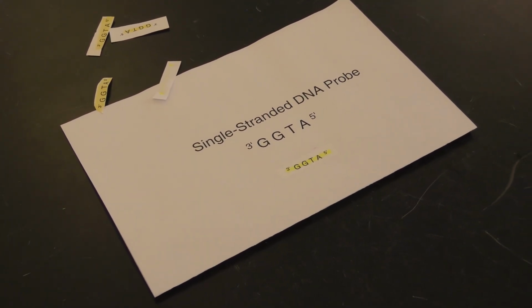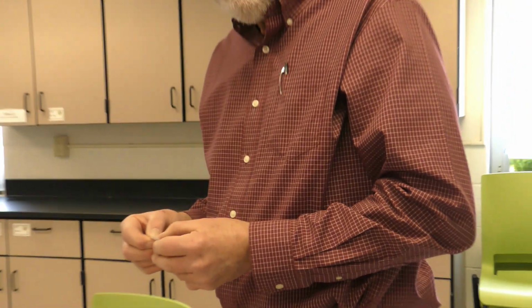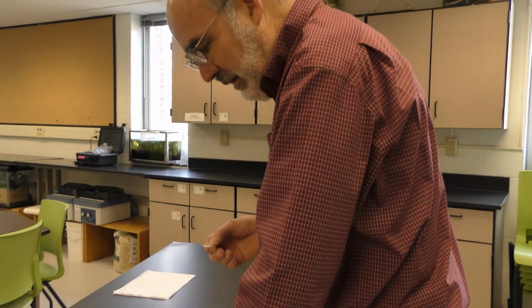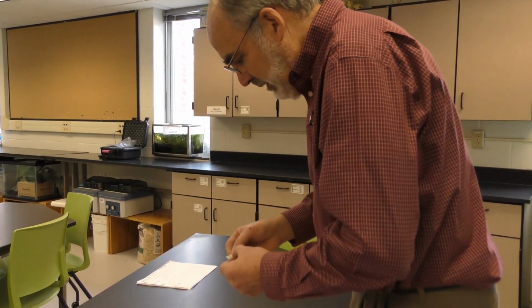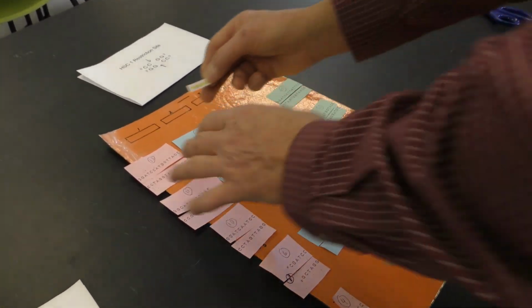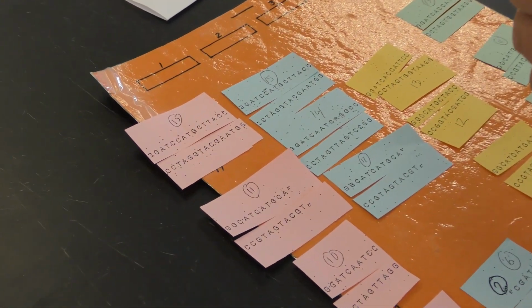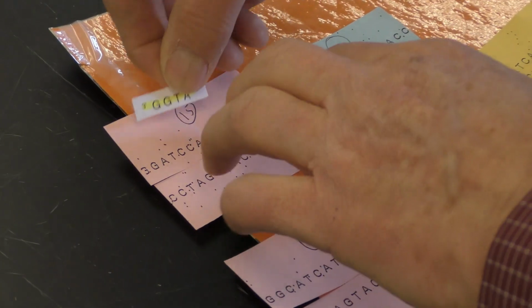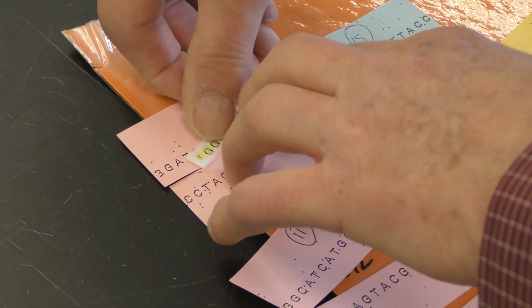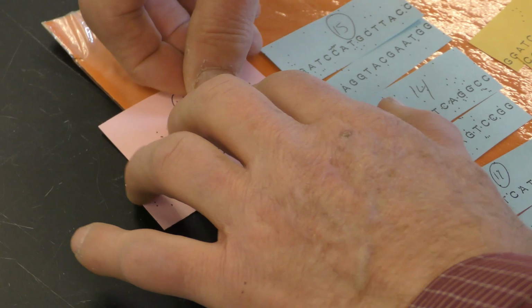Now, think in your head, what you know about the DNA sequences and structure, what they bind to, what's a complementary sequence to GGTA? Okay, it would be CCAT, okay? And since this probe is in the 3' to 5' direction, it's going to hybridize with the CCAT on the top strand, which is in the opposite direction. So look at the top strand of all those fragments for a CCAT, and I found one right here. And so that probe will hybridize with that sequence. And best I can, I'm going to put it right there. CCAT. So that fragment is labeled.